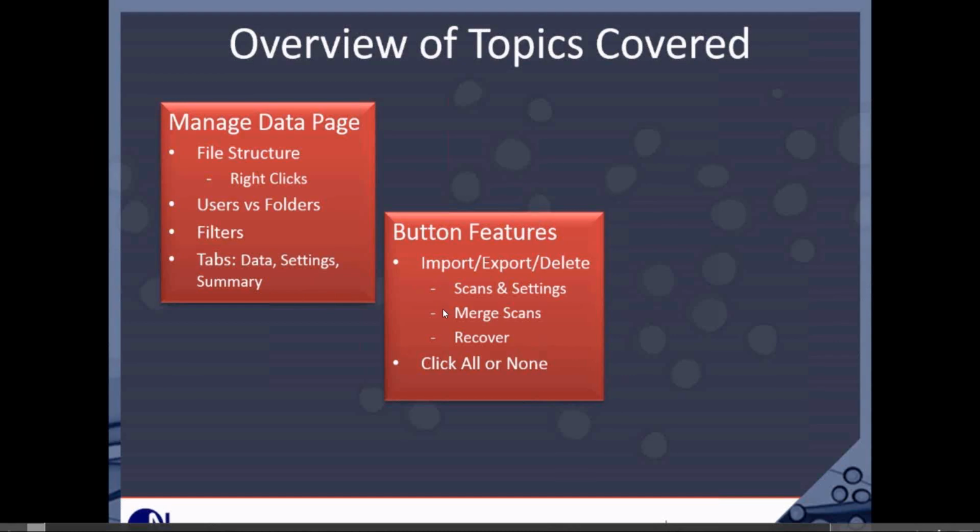You can actually merge scans together. That's something I've shown some users that didn't realize they didn't need to create multiple scan IDs for the same plate. And then how do you recover or re-import your data? And then how do you check all and uncheck all?